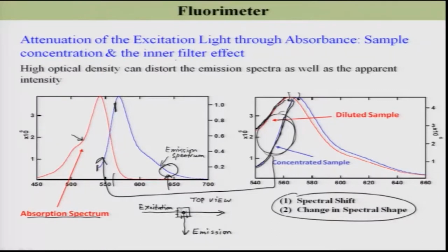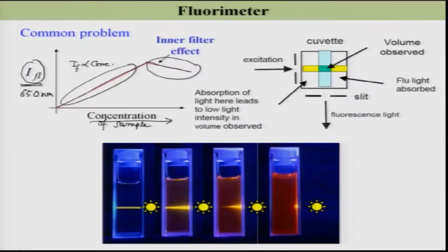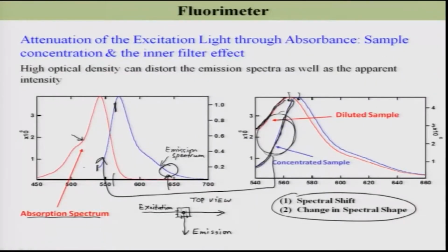So, in this particular experiment, I have set the excitation wavelength as, let us say for example, 520 nanometer excitation and let us say 650 nanometer emission. Please note it, I will highlight it. Right.